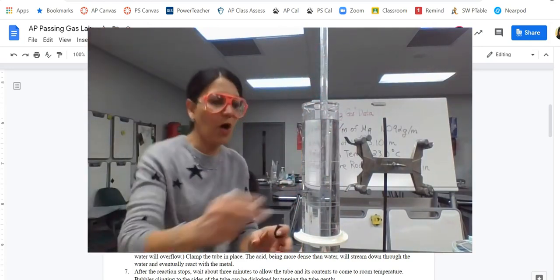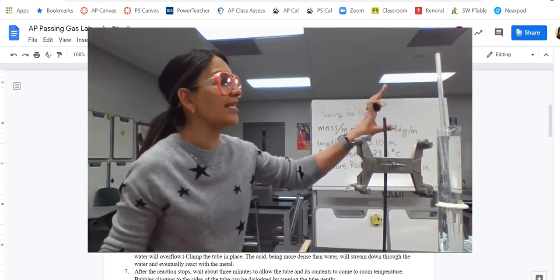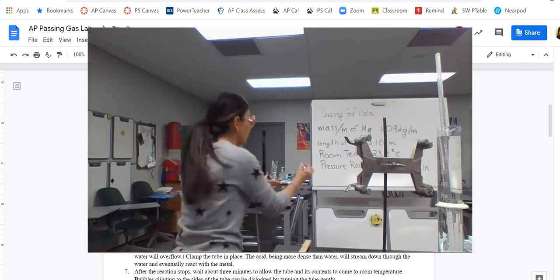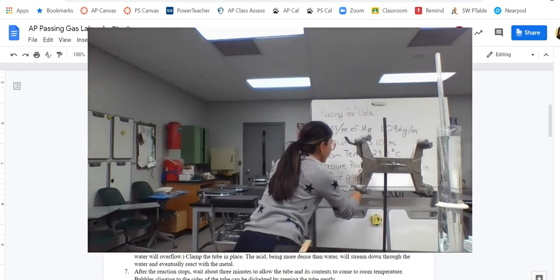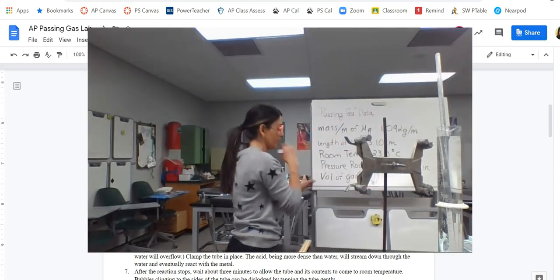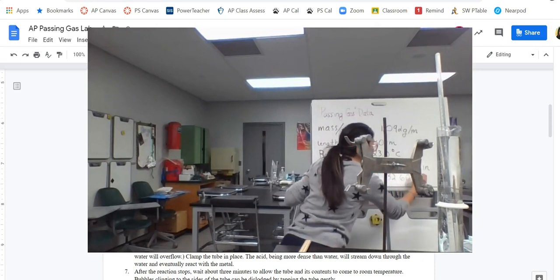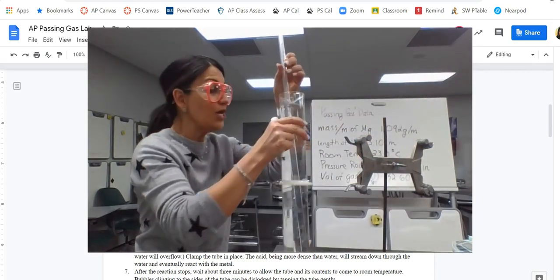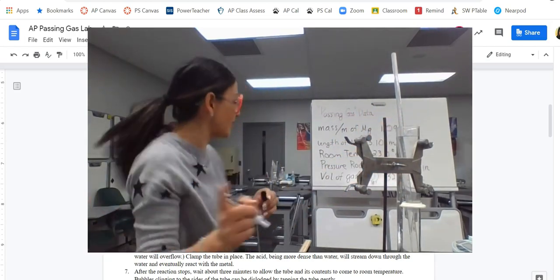So this is the volume of the gas, but don't forget, it's a mixture, okay? So this is the volume of gas plus the water vapor, I should say water in the gas phase, okay? And so we said 32.60. What unit is that? That's milliliters. This is actually measuring in milliliters, okay? So be careful because anytime we're doing gas laws, we're not in milliliters, we're in liters, so keep that in mind, okay?